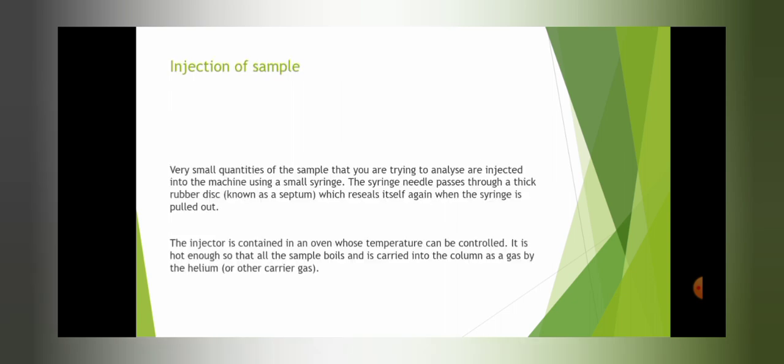Injection of a sample in the GC. This explains how a sample is injected into the GC. Bearing in mind that we have two different sample injection systems: the split and splitless injection systems.